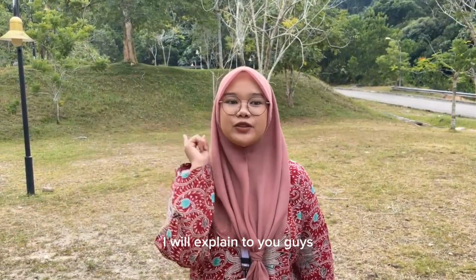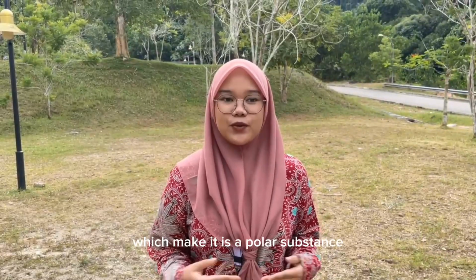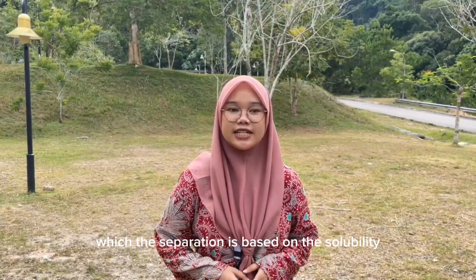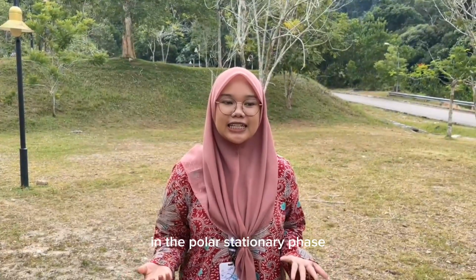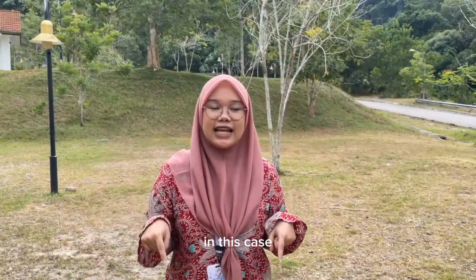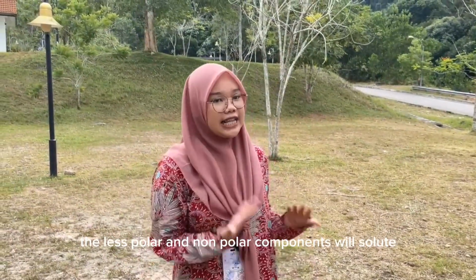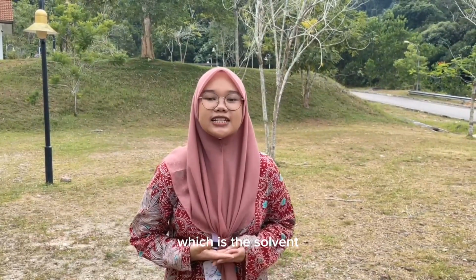Now, I will explain to you guys how paper chromatography works. Paper is made of cellulose, which makes it a polar substance. As we know, paper chromatography is a partition technique in which the separation is based on solubility. The polar components will be more soluble in the polar stationary phase, which is the water trapped in the paper. In this case, the polar components will be carried out late because they are attracted to the polar stationary phase. Meanwhile, the less polar and non-polar components will dissolve in the non-polar mobile phase, which is the solvent.